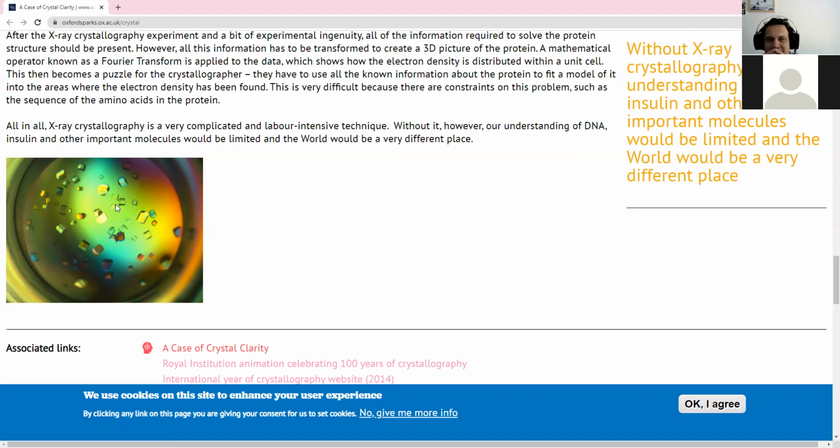So the idea is that what we're looking for here is how the hydrogens are arranged. Or what we're talking about, the electron density. So we take this protein, or the crystals, we put them in front of a, what are the things where they test the physics?